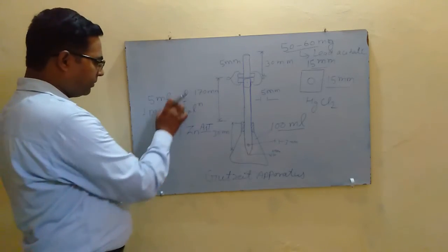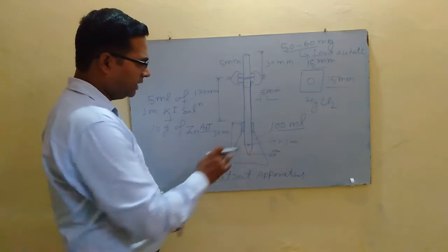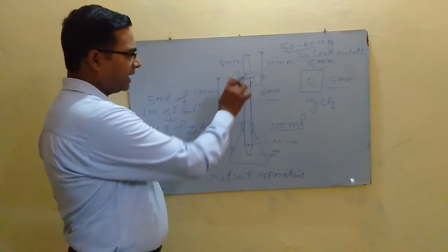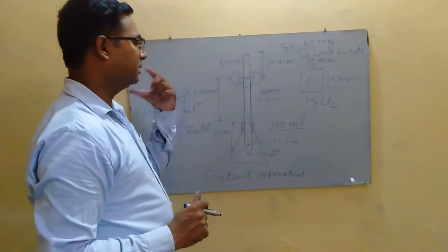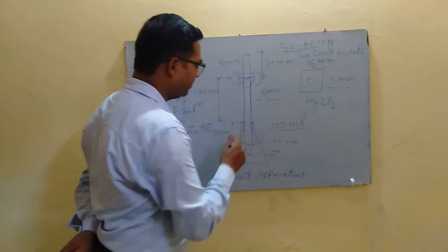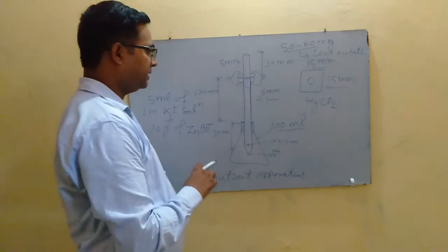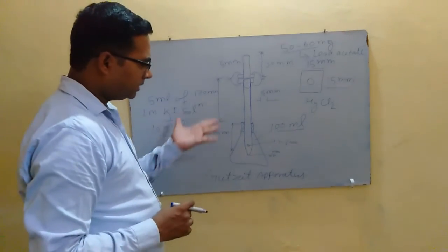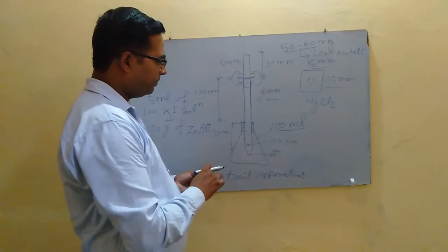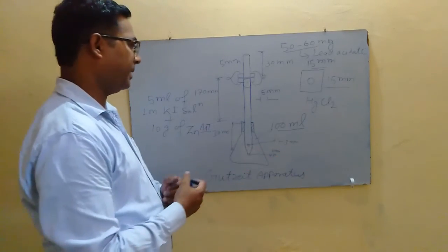After adding potassium iodide and zinc AST, this assembly is set as per the guideline mentioned in the pharmacopoeia, and it is placed on the water bath at a temperature such that the gas evolved is uniform in both the test and standard Gutzeit apparatus.